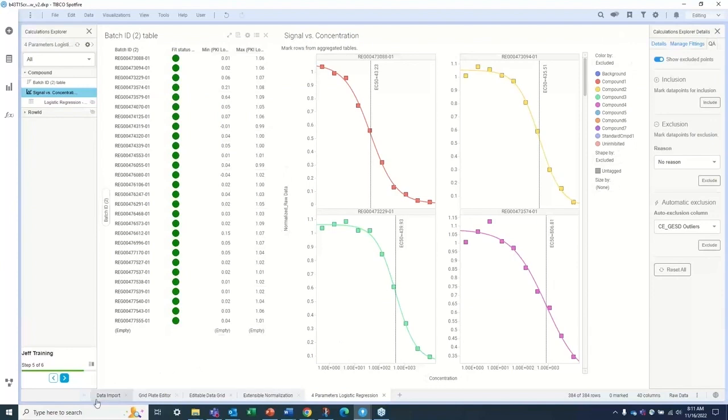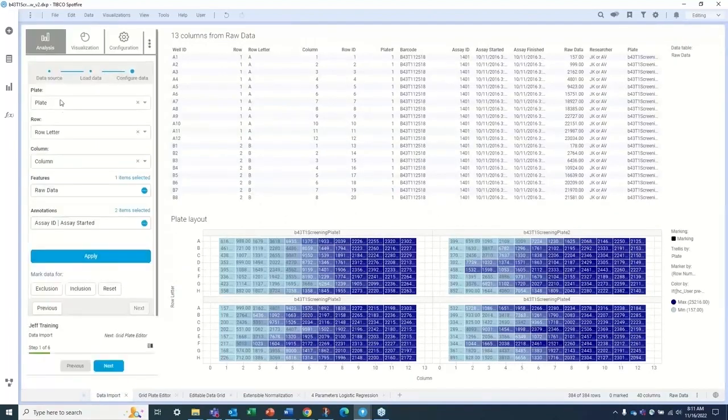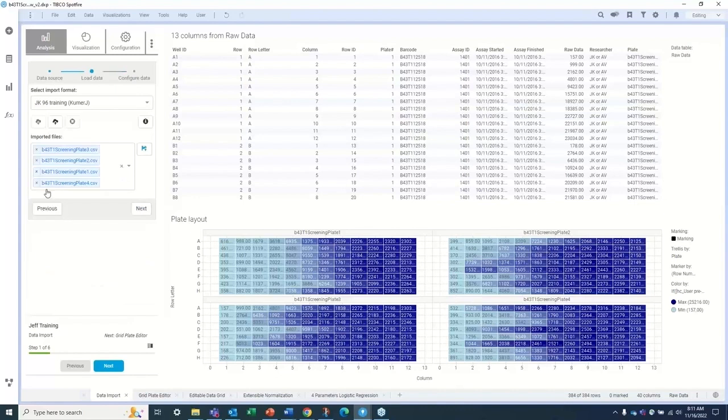And I do want to show from Signals VitroVivo, I'm not going to go into the details of what Signals VitroVivo does, but I'm just going to point out the connections here. So one of the connections is from the data source.